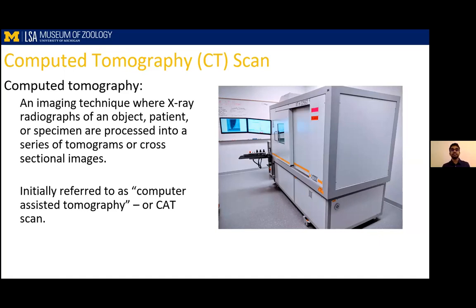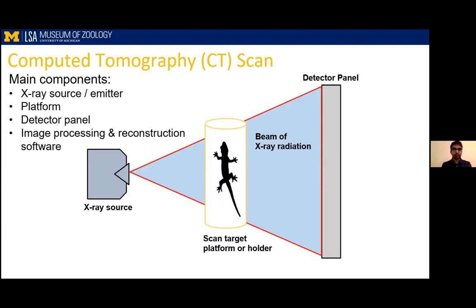Originally, when this technology first came about, it was referred to as computer-assisted tomography, otherwise known as CAT scanning. So if you've ever heard the term CAT scan, CAT scanning and CT scanning are in fact the exact same thing.